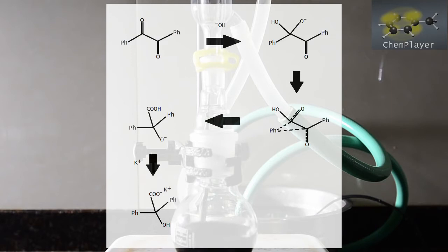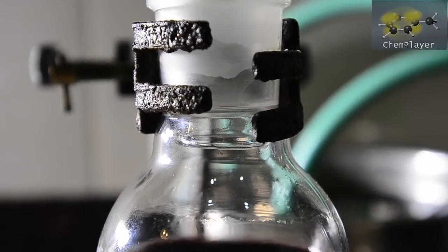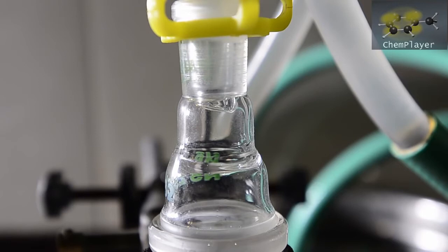In order to do this you can imagine an intermediate species which contains a 3-membered cyclic ring as the electron orbitals rearrange themselves. It doesn't seem likely when you look at it in theory, but it happens. The mixture is now starting to reflux gently, so we'll leave this now for 25 minutes more in order to react completely.